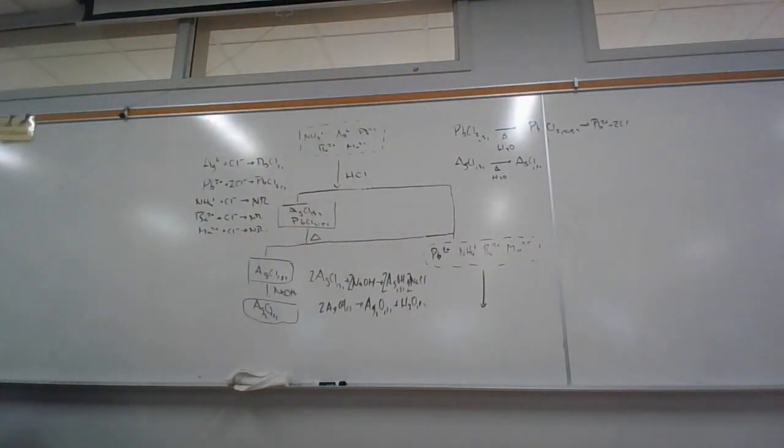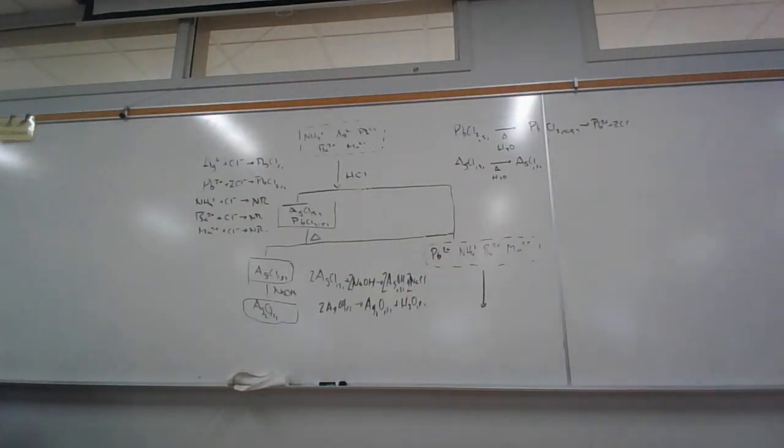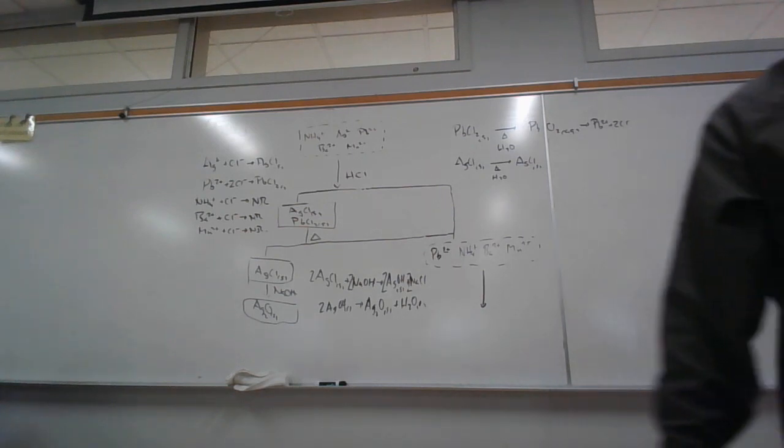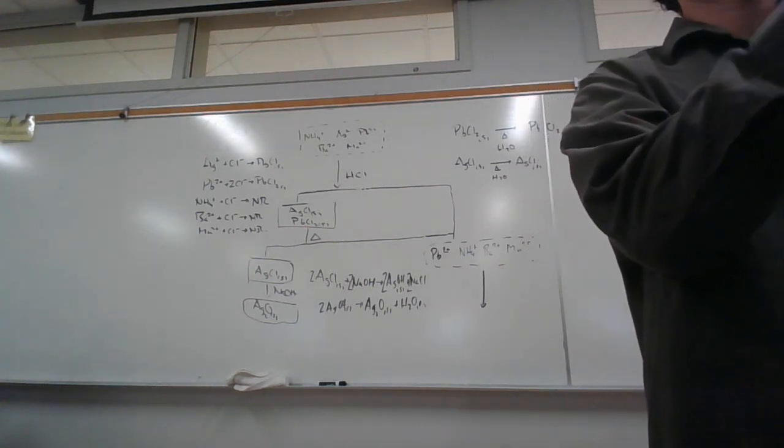And then I need some filter paper. The filter paper we usually have in a box. Let's see. There's filter paper back here. Yeah, it's in a box back here. It's just a round piece of filter paper. So we need to get this to fit into the funnel here. And the normal way people do that is they fold it into a quarter.